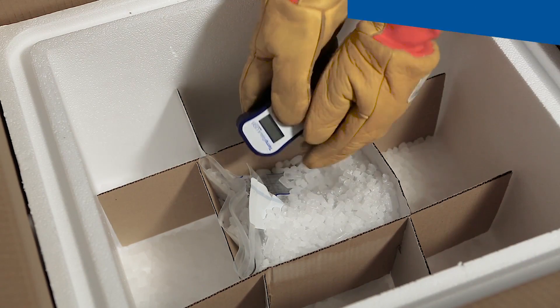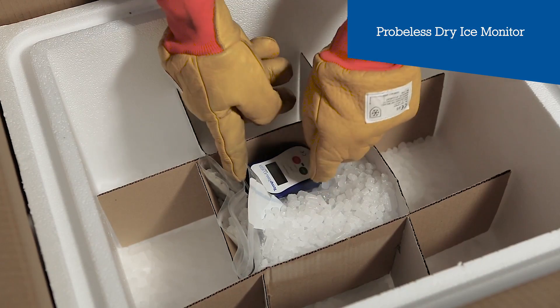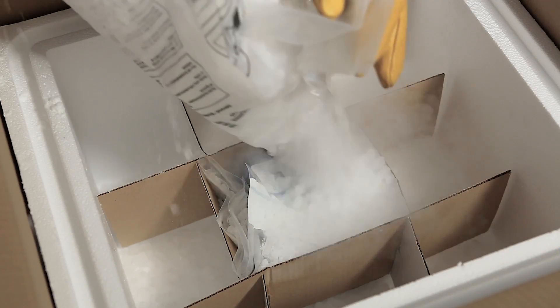A temperature monitor is activated and placed next to the 650 bags in the ice before being completely covered in dry ice. This will allow the shipper and consignee to check on arrival for temperature compliance throughout the journey.